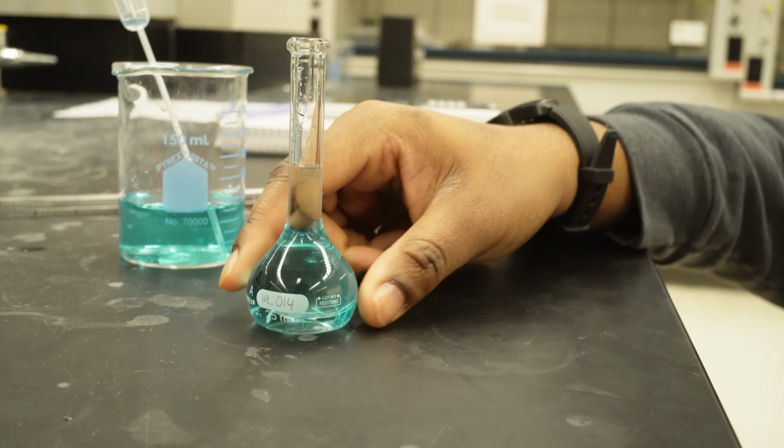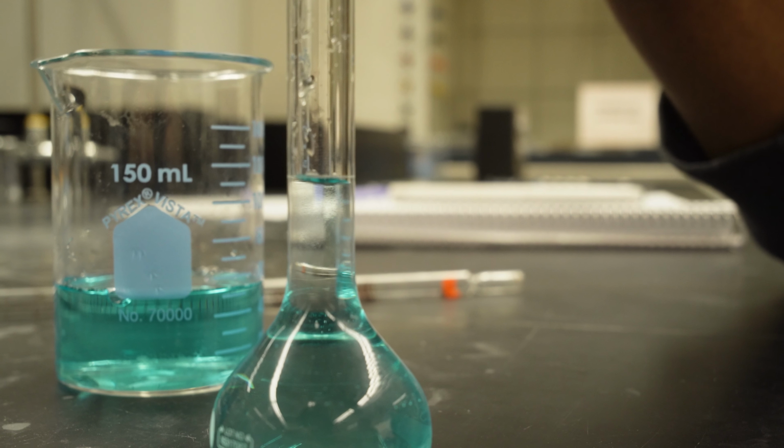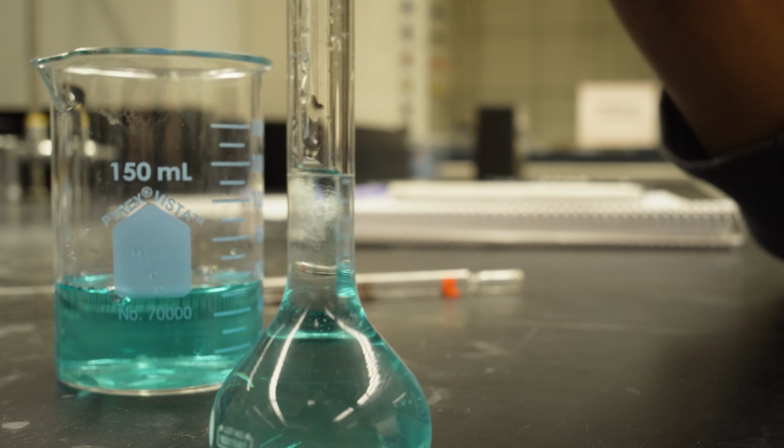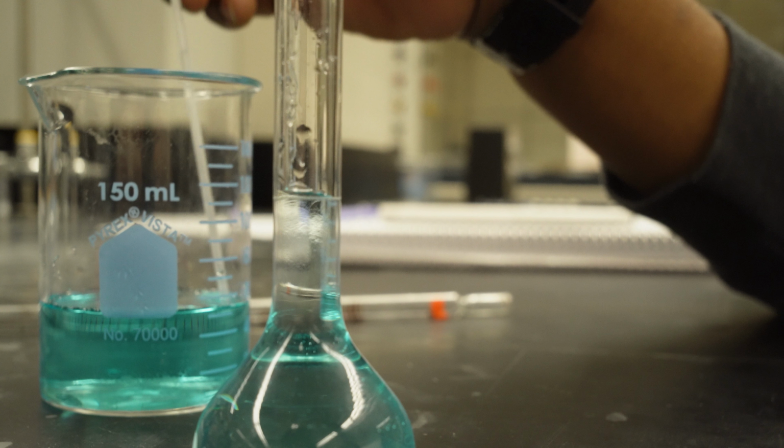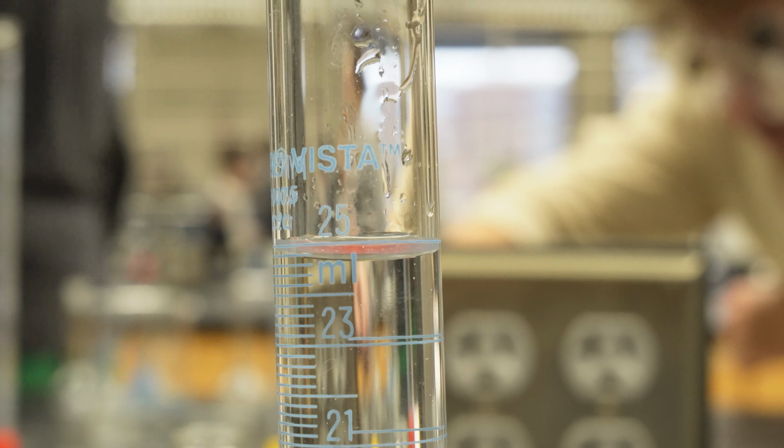When measuring volume, make sure to account for the meniscus. The meniscus is the U shape formed by the water due to surface tension when it sticks to the side of the walls. Always measure to the bottom of the meniscus. Here you can see the line is lined up with the bottom of the meniscus, meaning the volume is 25 milliliters. Here's a better view of a meniscus from a graduated cylinder.